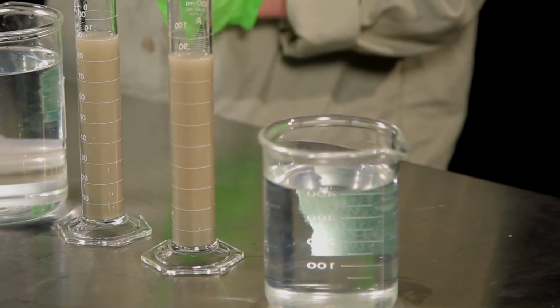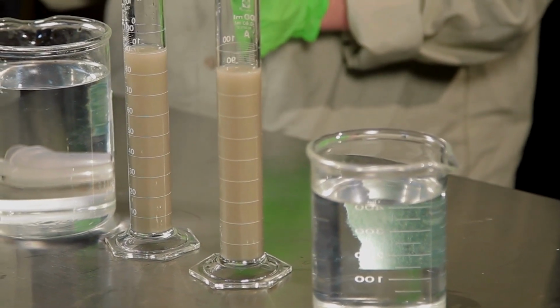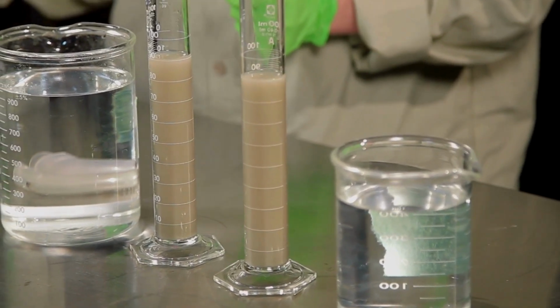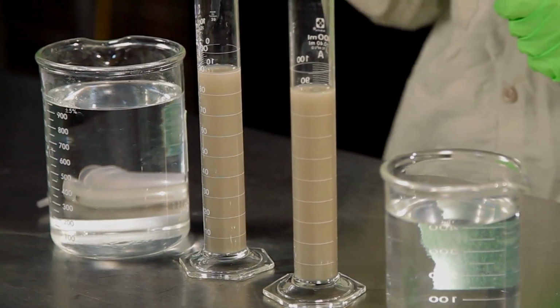As you can see, the sample is not naturally coagulating. Even when the slurry is left to stand on its own, some particles stay suspended and remain dispersed. When this happens, the sample is said to be colloidally stable.